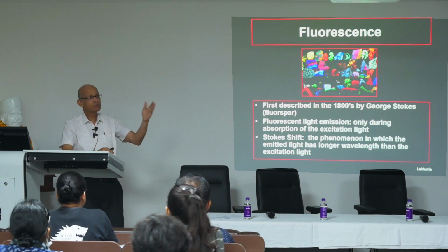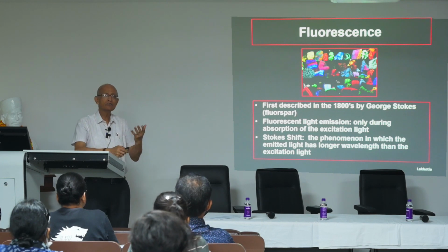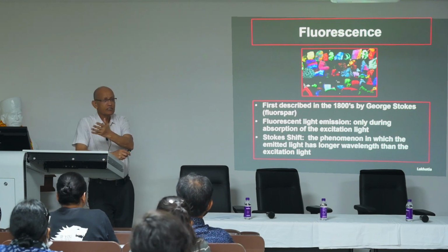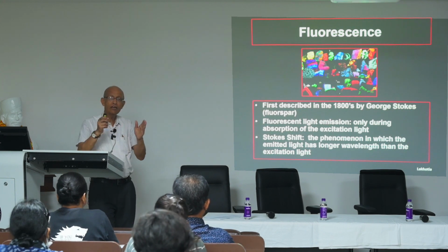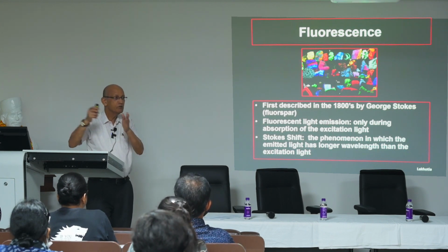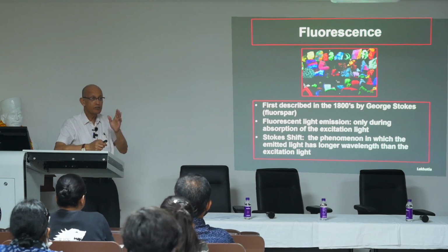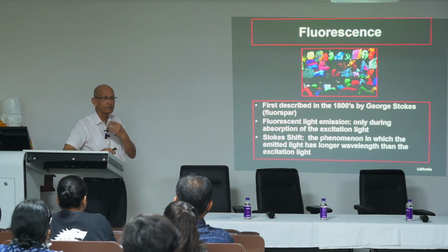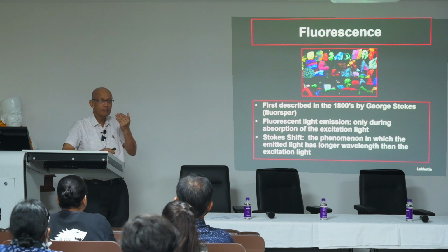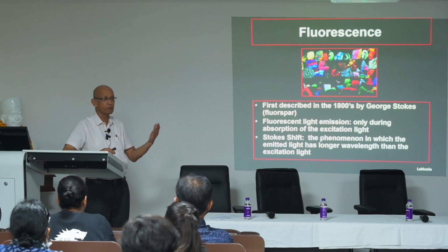The white light has a spectrum, and for the visible spectrum that we can see, let's say about 450 to 650 nanometers is our range approximately. Between that we make out different colors from violet to red. When white light falls on a dress, depending upon its constitution, some wavelengths are absorbed and others are reflected. So when we say red dress, that means only the red wavelength is reflected, others are absorbed.